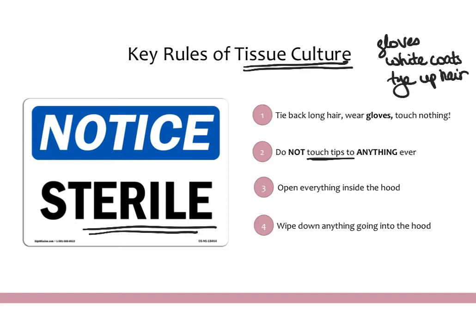You want to make sure that anything you open, you open inside the hood after spraying it down. Things used for TC should never be opened outside the hood because then they're contaminated. Anything going into the hood should be wiped down with 70% ethanol before you put it in. Once you've opened a solution outside the hood, it's really considered not sterile, and you probably shouldn't use it unless you filter or sterilize it before bringing it inside.